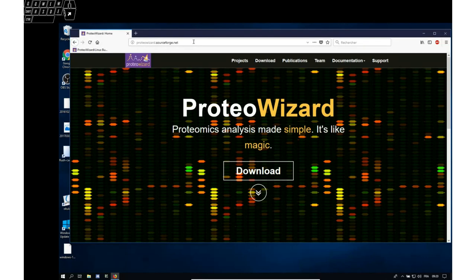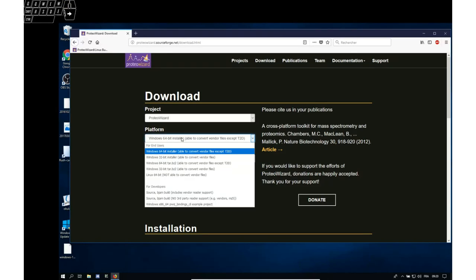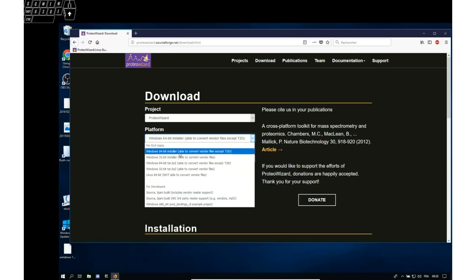So the first thing to do is to download the ProtoWizard software and in particular to select the proper binary, that is either install the 64-bit installer or install the 32-bit installer.